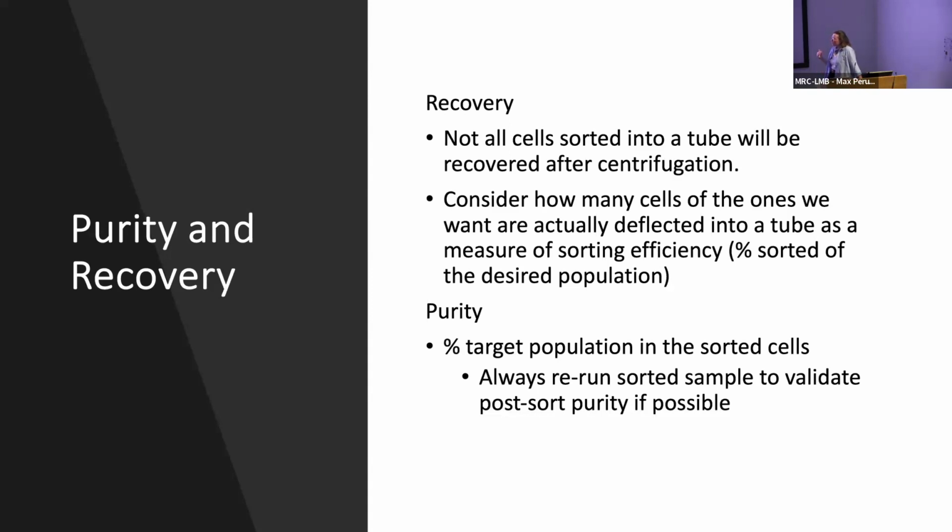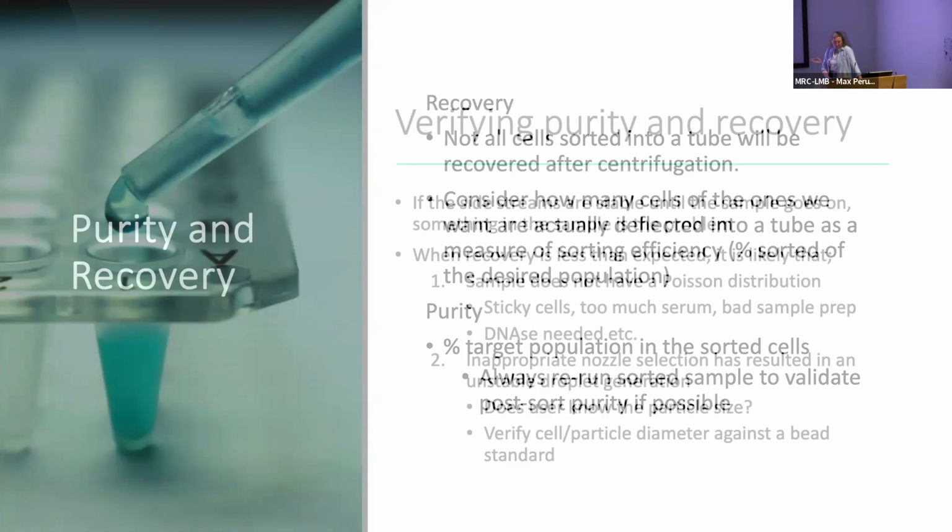And when we talk about purity, and I haven't mentioned this yet, I'm talking about anything over 95%. I would say anything under that is probably not great. So it really should be over 95 to upwards of 99% purity.